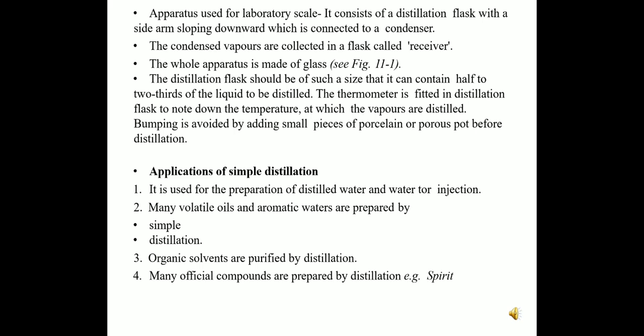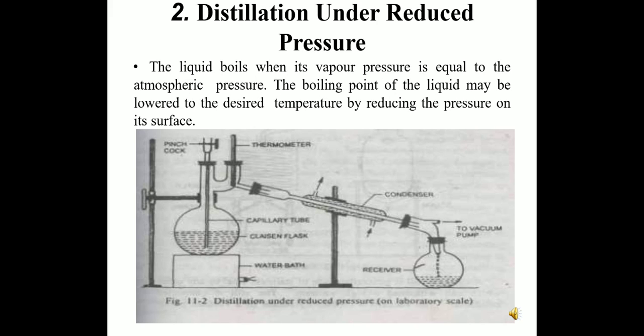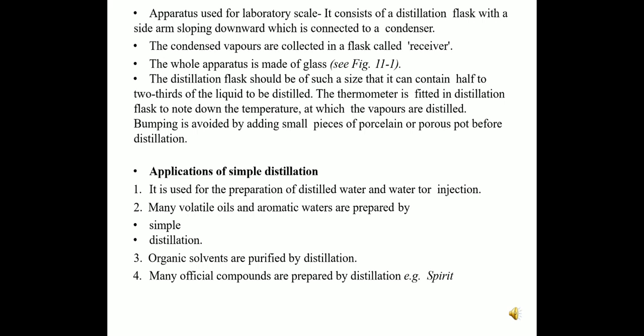Talking about the application of simple distillation, it is used for preparation of distilled water and water for injections. Many volatile oils and aromatic waters are prepared by simple distillation. Organic solvents are purified by distillation. Many official compounds are prepared by distillation, for example, spirits.